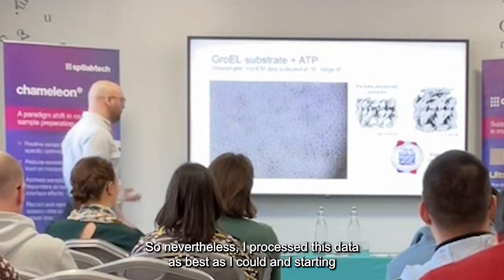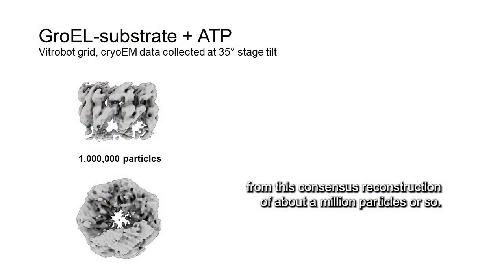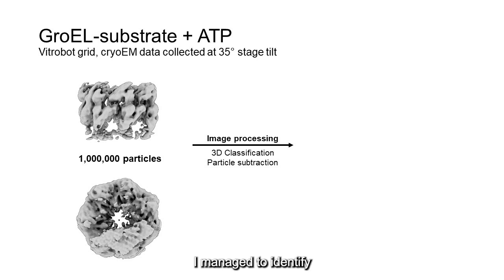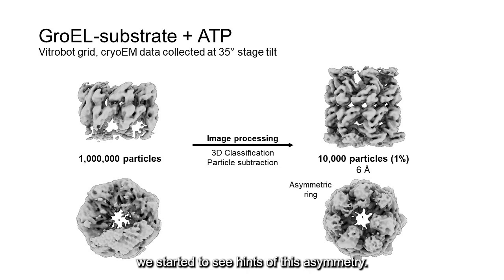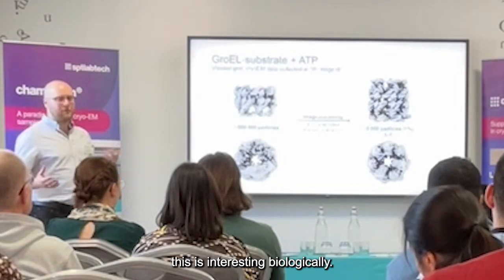Nevertheless, I processed this data as best as I could. Starting from an initial reconstruction of about a million particles or so, I used some fancy image processing techniques and classifications and managed to identify a subset of about 10,000 particles — so about 1% of the data — which had a relatively more complete complex. And in this complex, we started to see some asymmetry, where one of the rings appeared asymmetric, which was interesting.